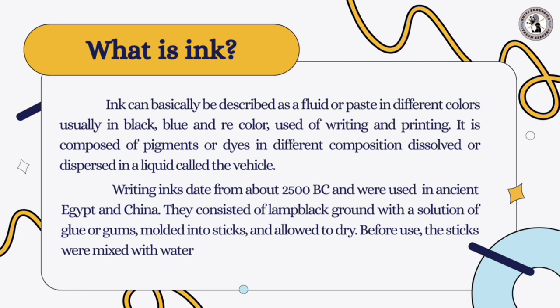Basically, what is ink analysis? So, ink is described as a fluid or paste in different colors, usually black, blue, or red in color, which is used for writing, printing, or composing any letters on paper or any sheet.